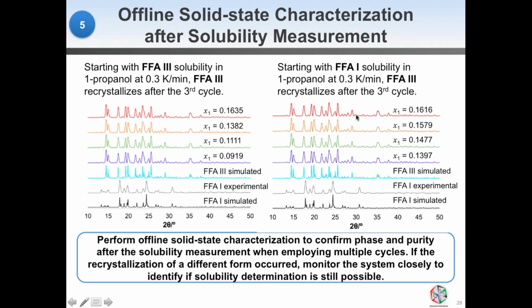While the solubility of FFA form 3 could be averaged over the three cycles, that of FFA form 1 needs to be carefully evaluated after each of the cycles to determine if the measurement of the solubility is still possible. Dr. Stelzer will provide guidance on how we can monitor solid state changes within and between heating cycles.